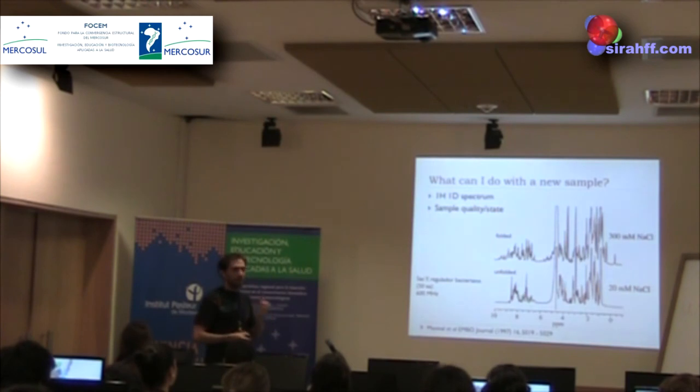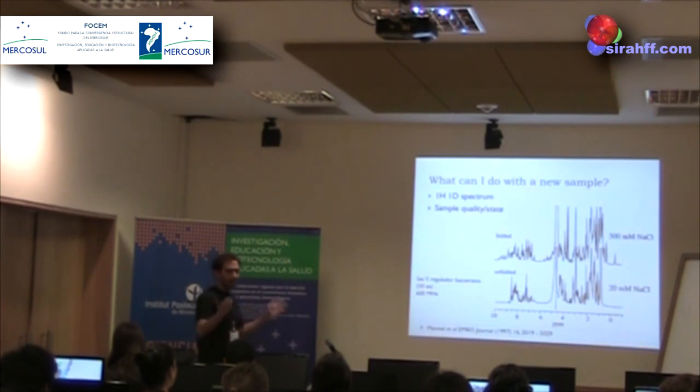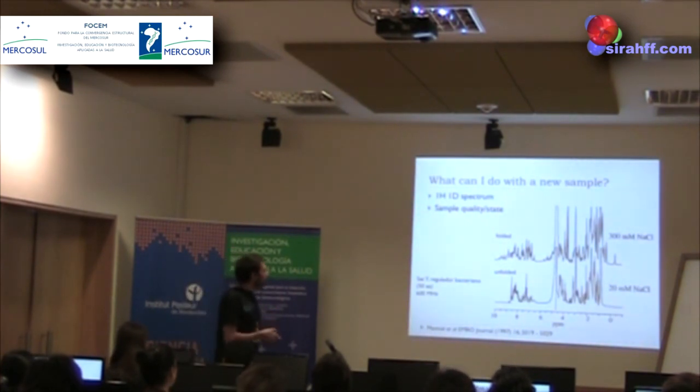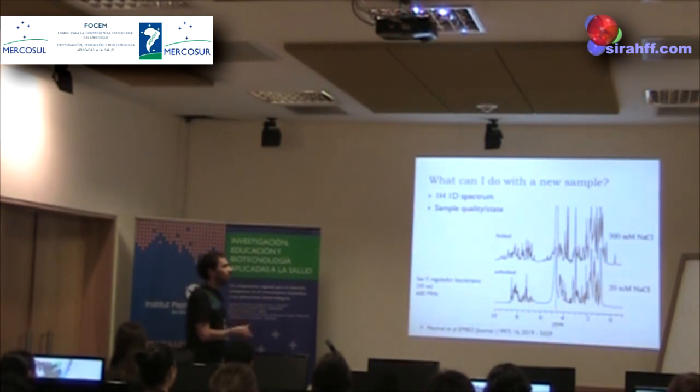Well, when you have a new sample, you put your sample in the spectrometer and you acquire a proton 1D spectrum, right? Protons are always there, so you don't need to label with fancy things. The proton spectrum will tell you immediately about the quality and state of your sample. So here you have a spectrum of the same protein in a folded state and an unfolded state.